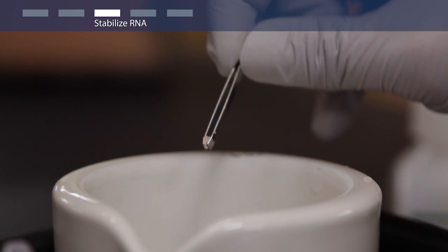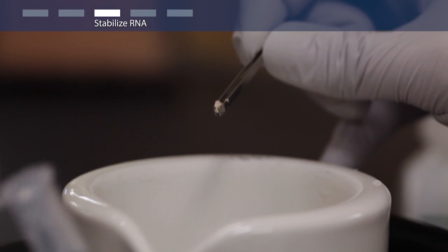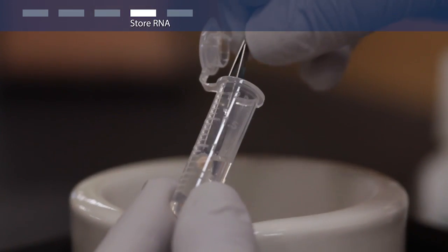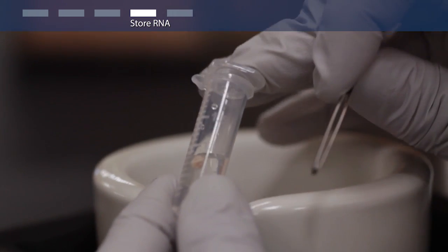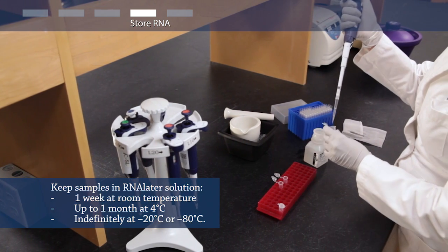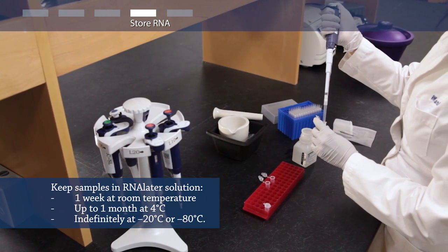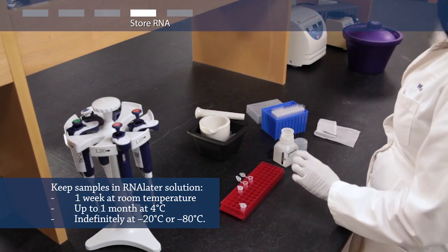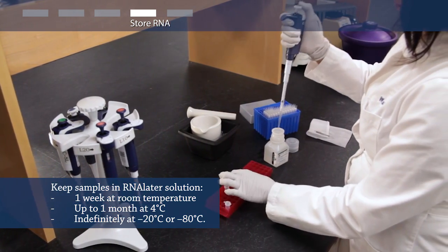Once your tissue sample is prepared, place it in 5 to 10 volumes of RNA-Later Solution. Most tissue samples can be kept in RNA-Later Solution for a week at room temperature, for up to a month at 4 degrees Celsius, and indefinitely at minus 20 or minus 80 degrees Celsius.